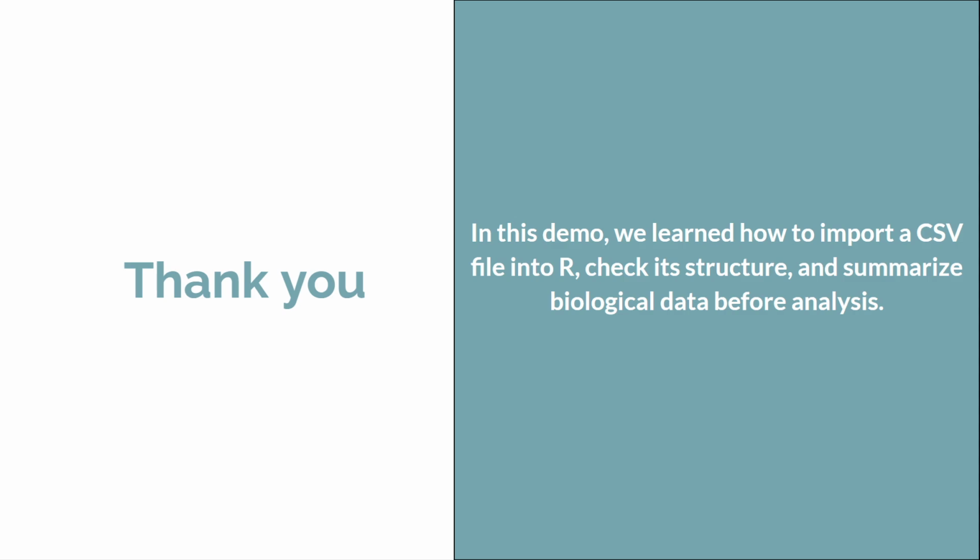After importing the dataset, we also used some functions, the head function and the summary function. So through all these things we get to know our dataset, and we viewed our dataset.